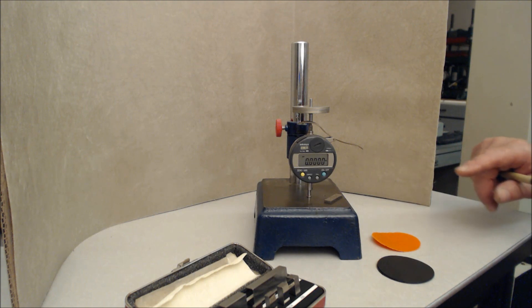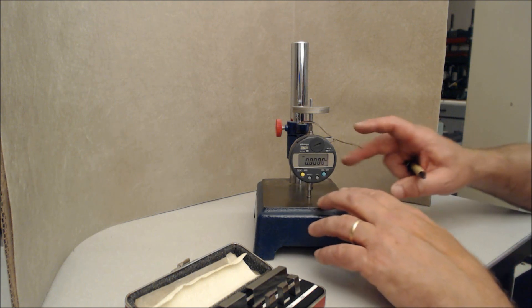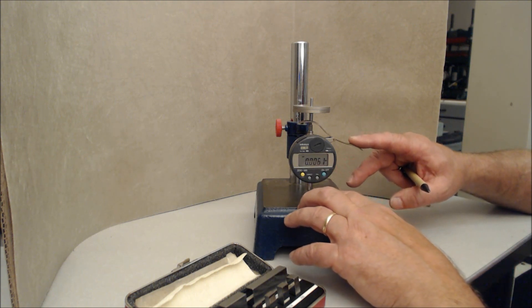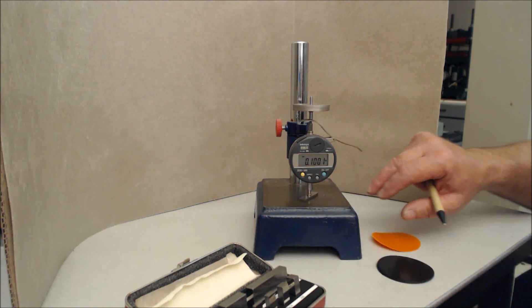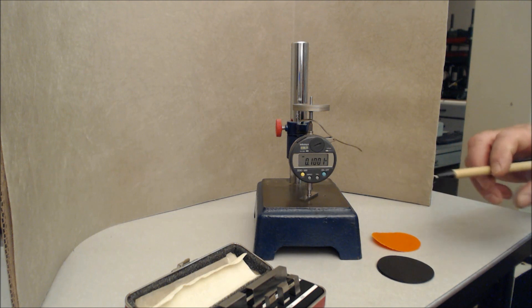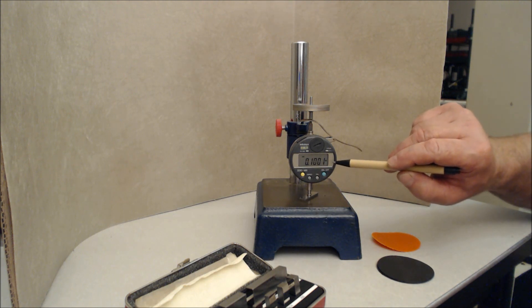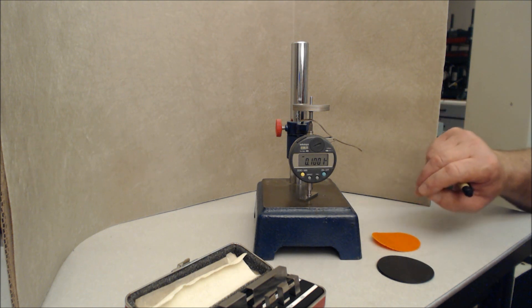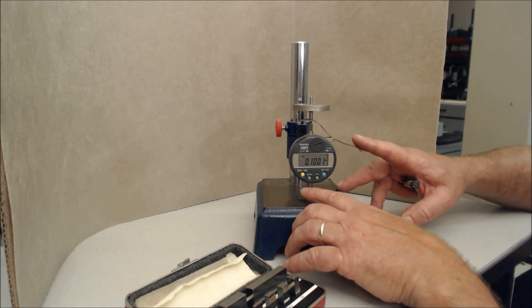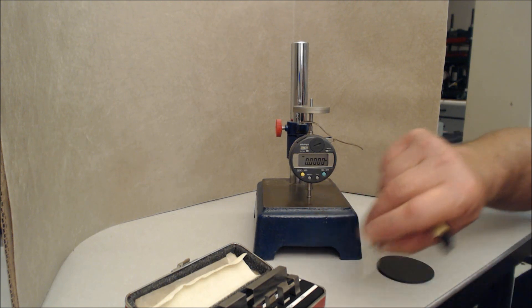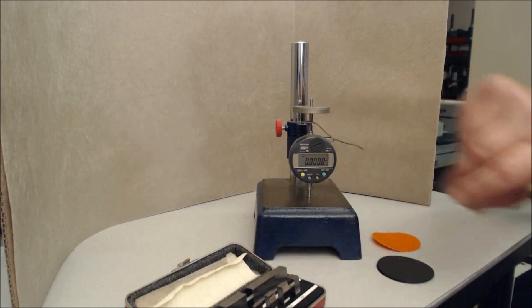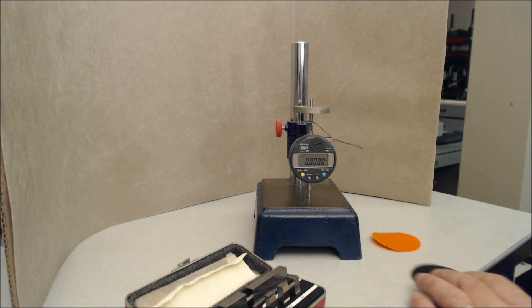To verify this device, we typically use a gauge block. This gauge block is 0.1 inches in thickness. Here you see we verified this—we're a little bit off to the ten-thousandths place, but this is within tolerance for us at GSI. We'd like to see a re-zero of the material, and it certainly gave that. Now we're ready to go as far as testing is concerned.